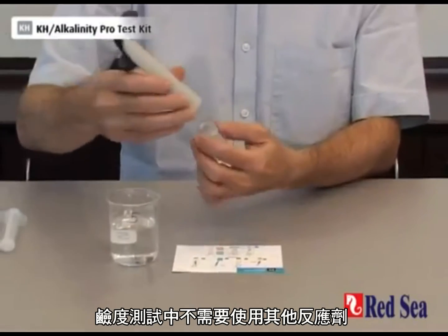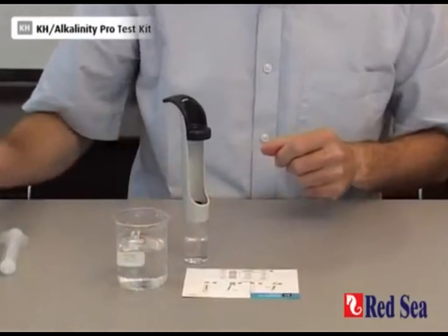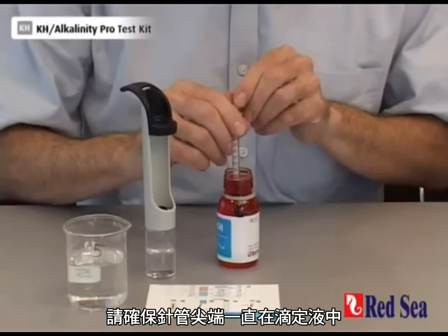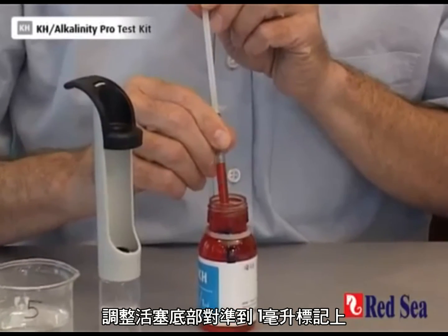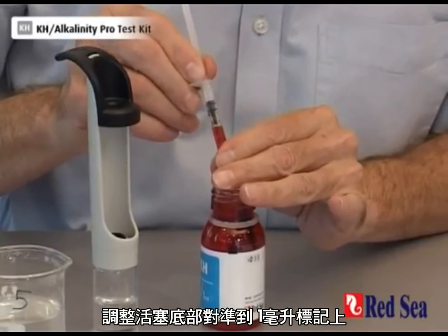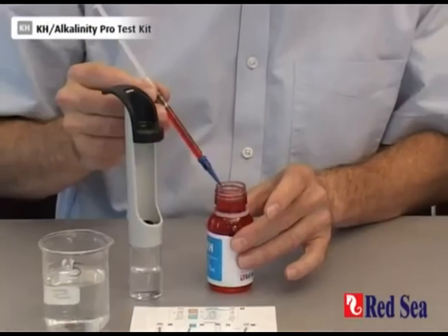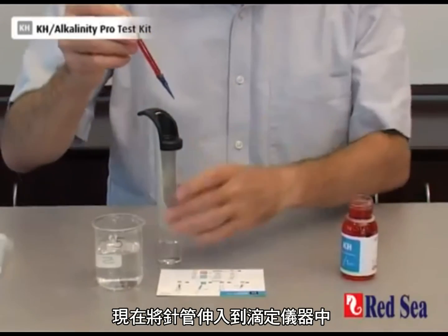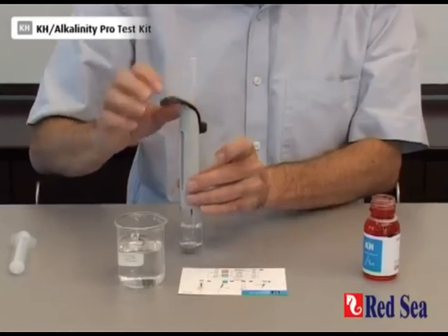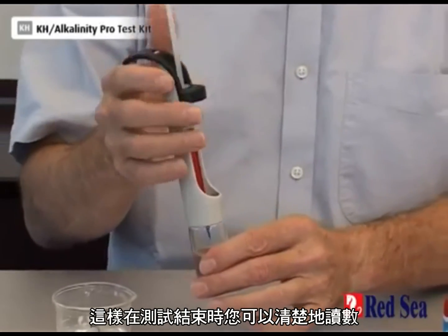There are no other reagents to use for the alkalinity, so you can screw the valve straight onto the titrator. Now we have to fill our syringe. When filling the syringe, make sure you keep the tip of the syringe in the titrant at all times, and then adjust the level so that the bottom of the plunger is on the 1 ml mark. Now place the syringe into the center of the titrator, making sure that the scale is opposite so you can see the reading at the end of the titration.